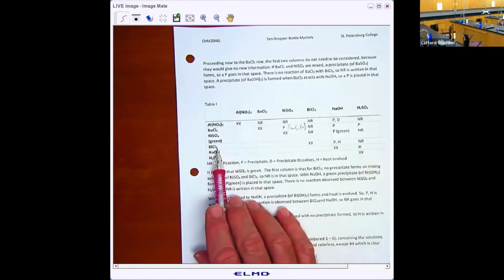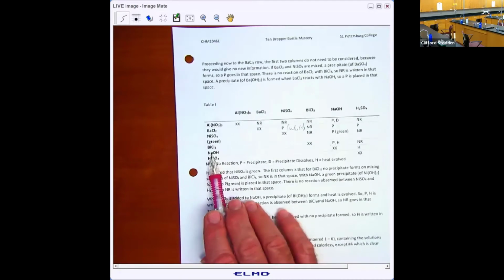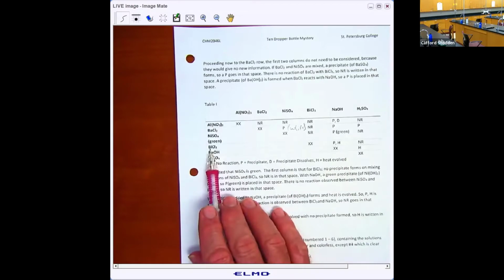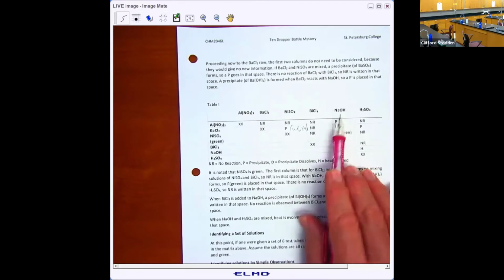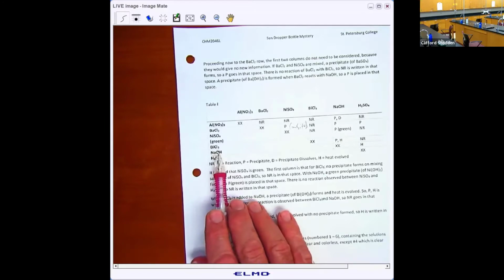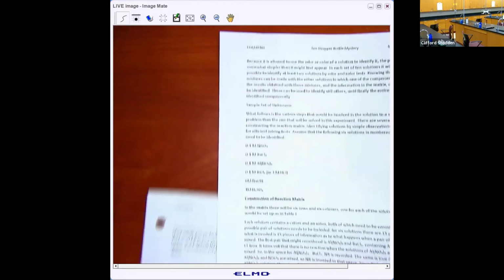Now you also see an H with the bismuth chloride mixed with sodium hydroxide, and that's not a reaction with the bismuth, but it's a reaction between the sodium hydroxide. The H part of it is a reaction between sodium hydroxide, the base, and the acid that this is dissolved in. If you look back at the original set of solutions, for bismuth chloride, it mentioned that it's dissolved in hydrochloric acid. Let me just put this sheet in there for a minute.